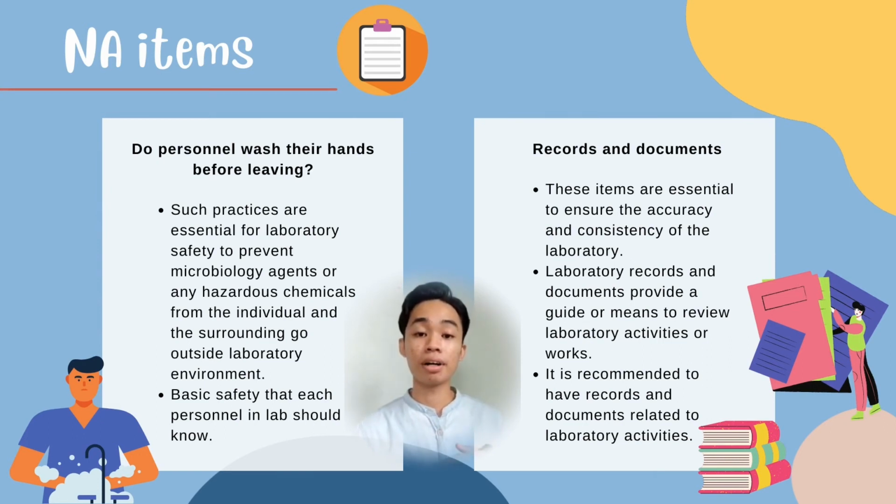Meanwhile, the documents and reports are really important to ensure the accuracy and consistency of the lab. Other than that, the records and documents also provide a guide or a means for the laboratory work, and it is really recommended to have documents and reports in every lab.